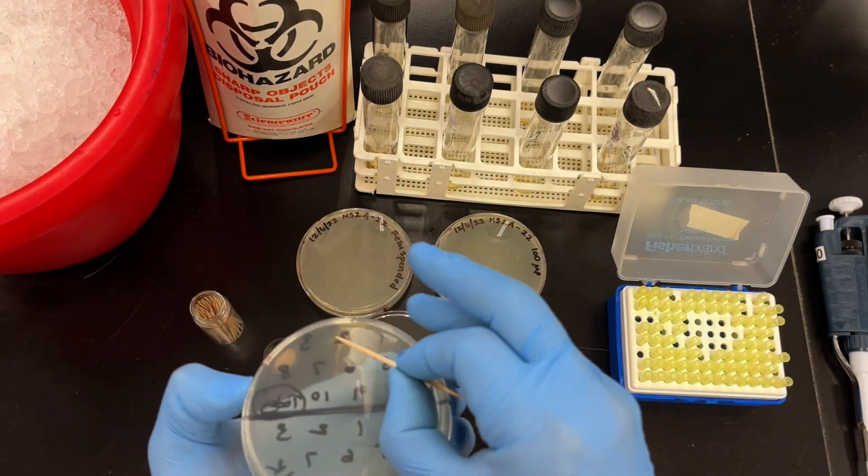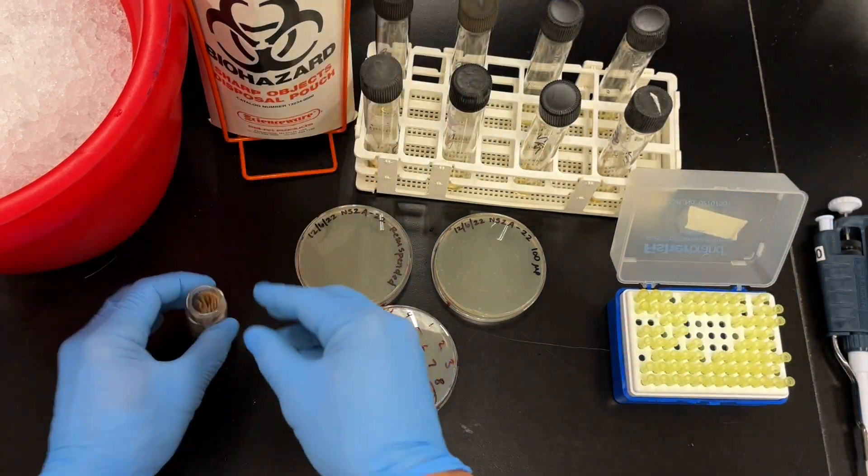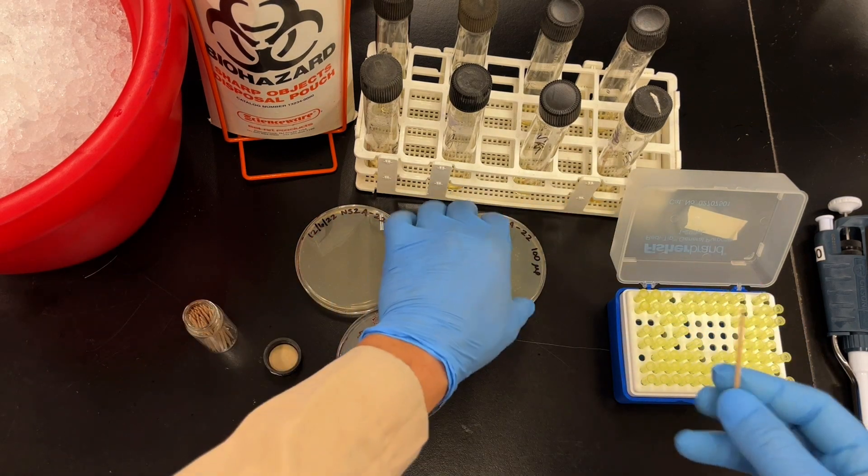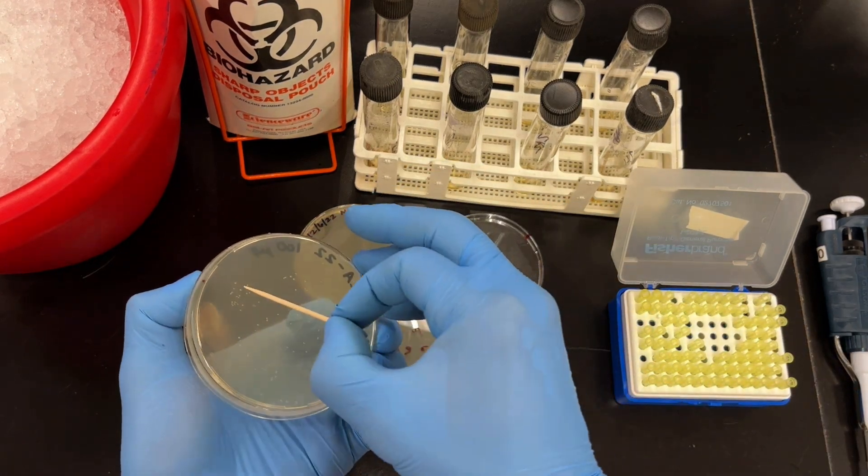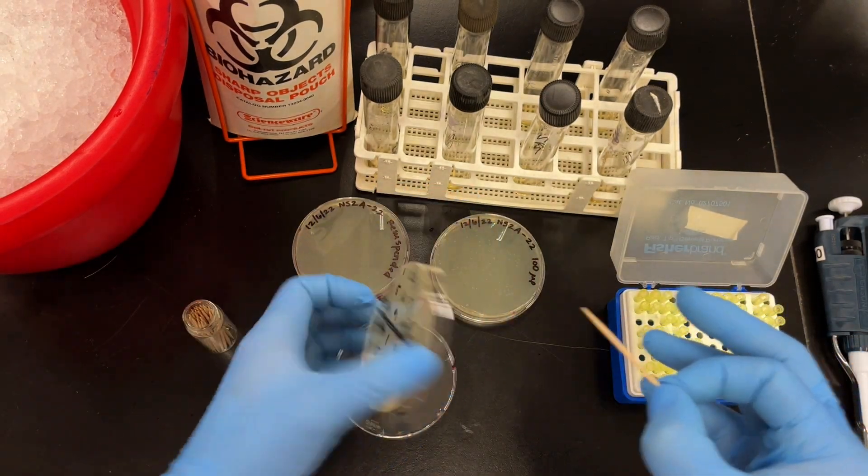Just note that the colonies you choose have to be well isolated, separated from each other. Make sure that you don't pick any that are touching each other or very close, because you want to pick individual clones. Otherwise you can run the risk of picking multiple clones in the same colony and getting ambiguous results.